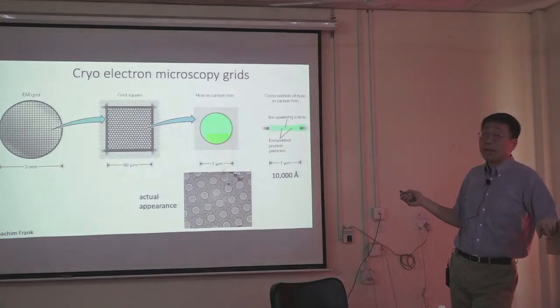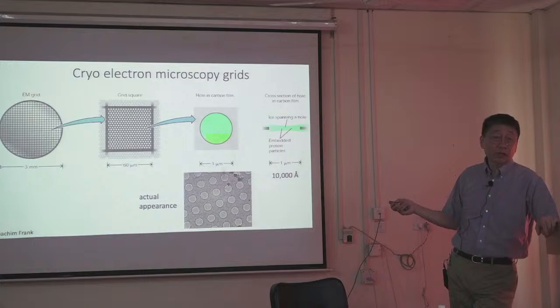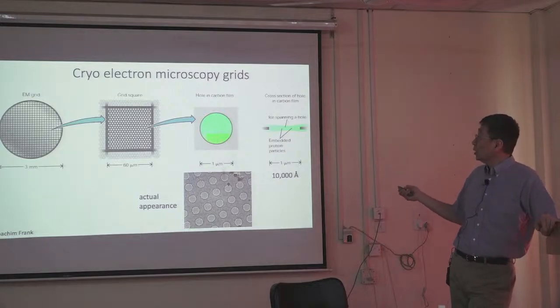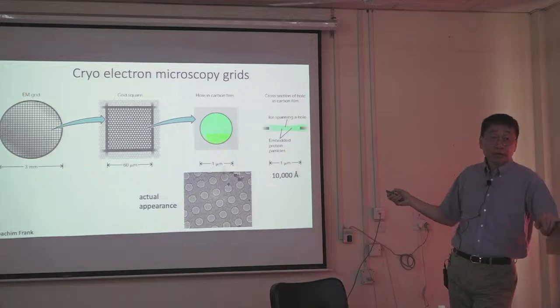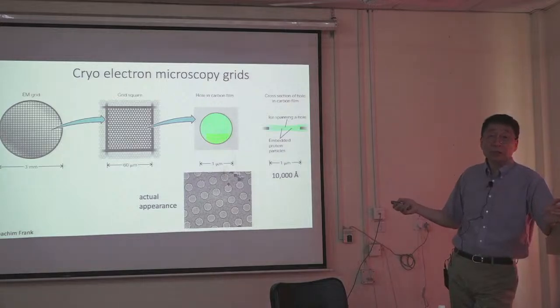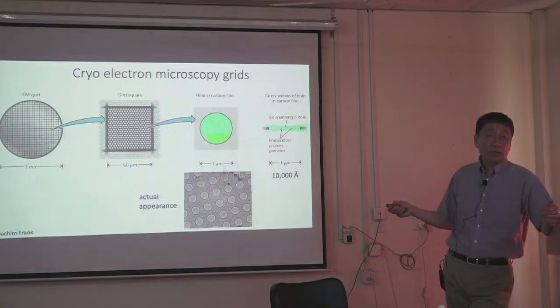And then when you have a good enough sample, you go to the cryo-EM, collect the data set, and see whether you can find your protein or not. Just like in crystallography we need a crystal, in cryo-EM you need a good sample. Once you have a good sample, you collect data on the cryo-EM, and you get the structure within a day or two, or if it's more complicated, maybe a week. The data analysis is very, very powerful, very, very routine nowadays.